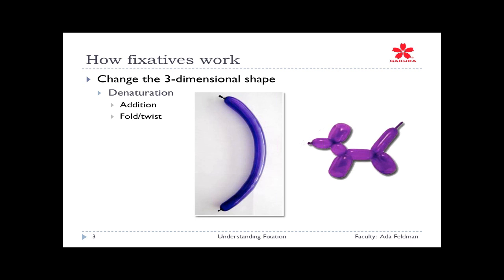Now, the way fixatives work, and we'll be talking about several of them this session, is that the fixative molecules add on to the molecule and cause it to fold and twist on itself. Instead of showing you a molecule, I have here on the screen a balloon, something simple to visualize.